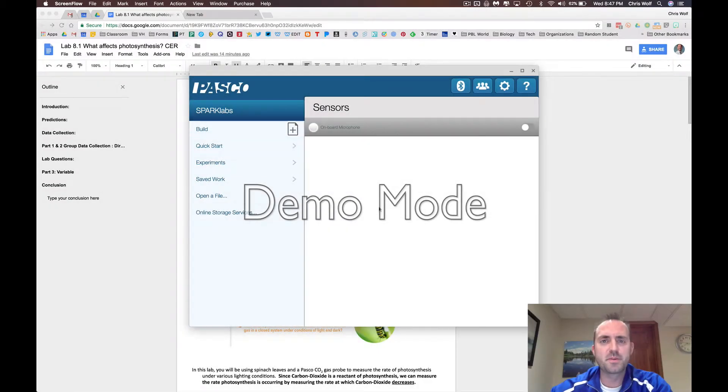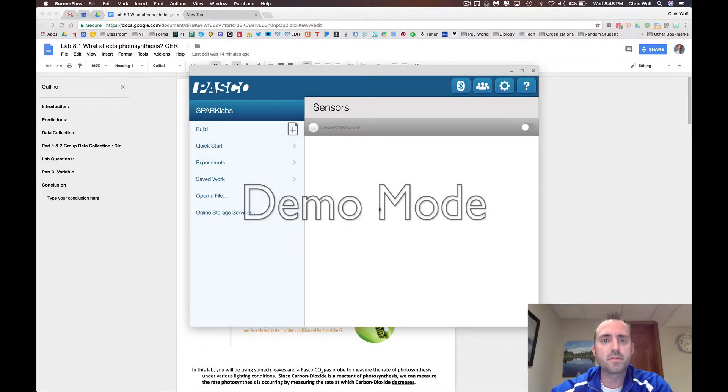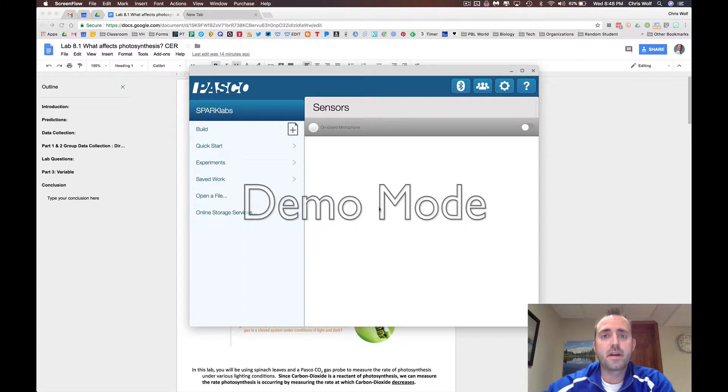Hey VHBio students, this is Mr. Wolf and in this video I'm going to show you how to use the PASCO SparkView data recording app that you can find on your Chromebook.